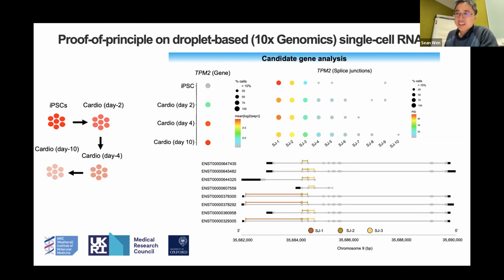And then once you finish your gene expression analysis, you might be interested to understand which isoforms are actually driving the changes that you see at the gene expression level. Or you may also want to identify isoforms that are active in your data set, but you don't see at the gene expression level, so that you have more candidate genes to move forward with.